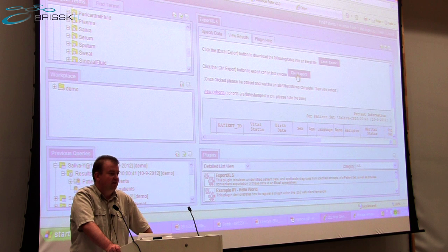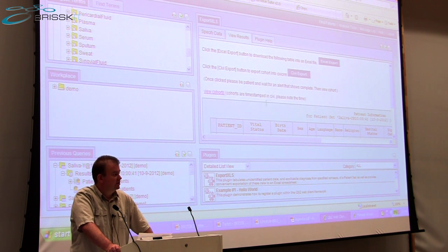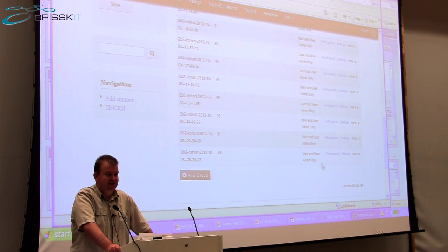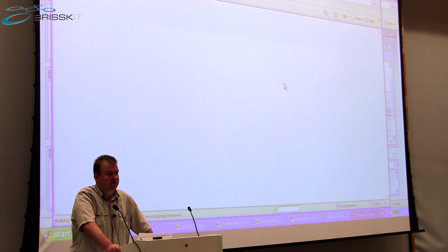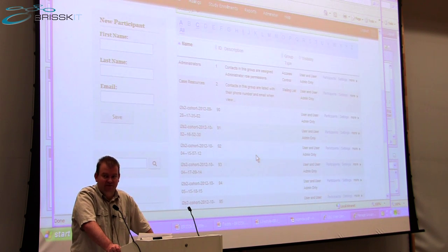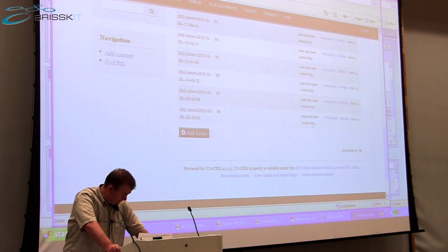I2B2, and you can, at the click of a button, send a specific email to those patients, or you can export their contact details, provided that you've got appropriate approvals to have access to the patients being re-identified, so that you can contact them and either ask them further questions or invite them back in for further analysis.